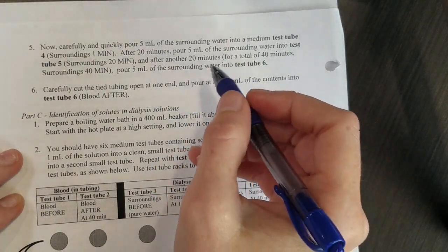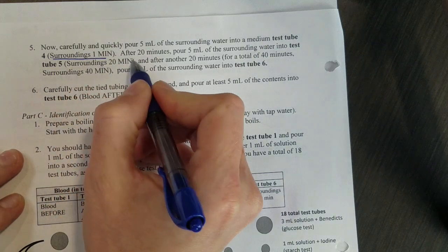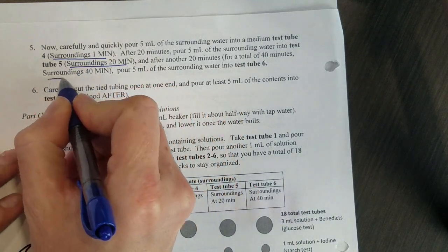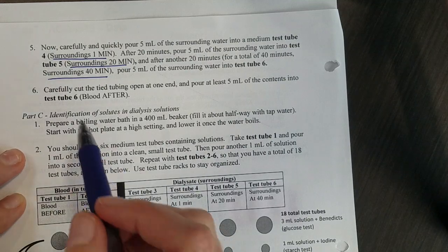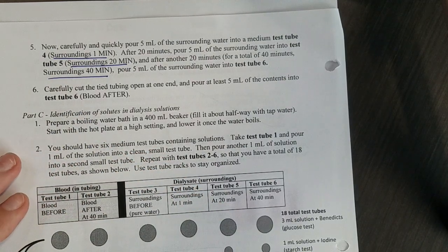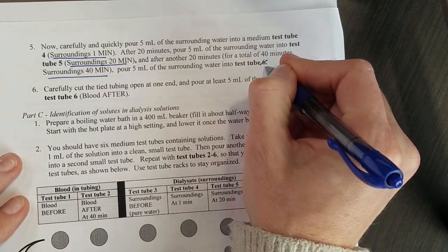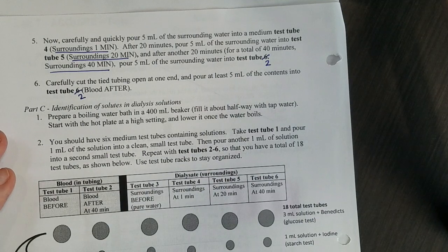After you've done that you're going to collect some of those surroundings at one minute, 20 minutes, and 40 minutes. Then at the end you'll take that tube of blood and dump it into a test tube. This says test tube six but it should be test tube two.